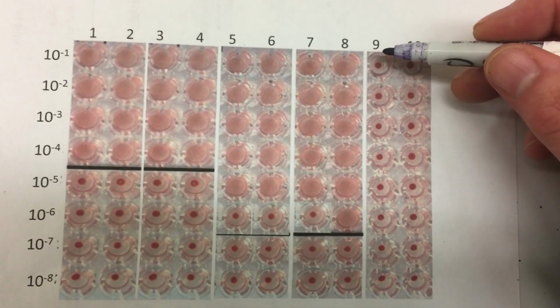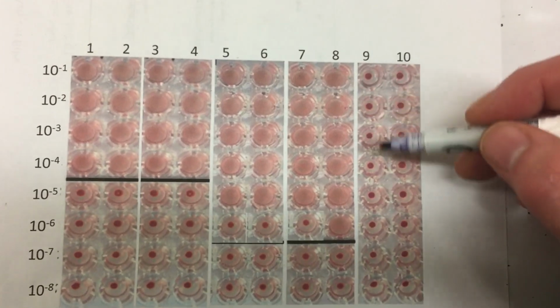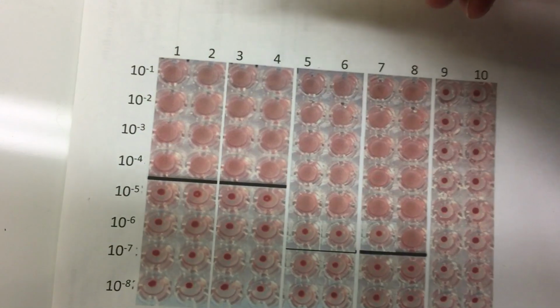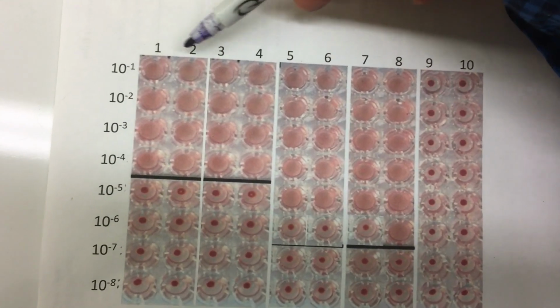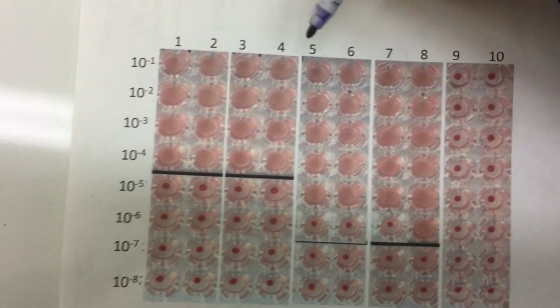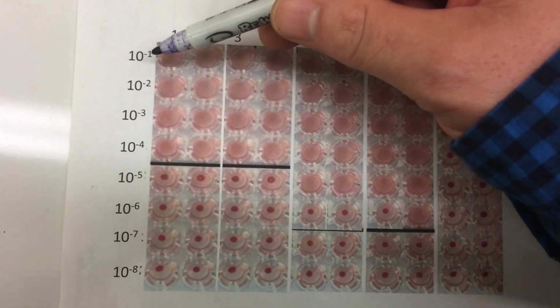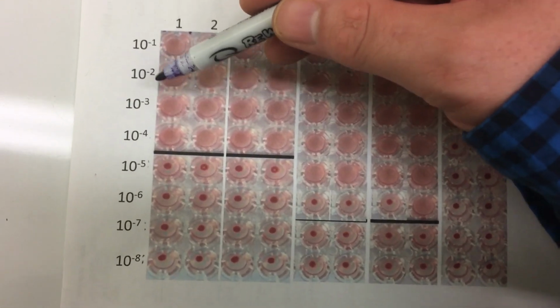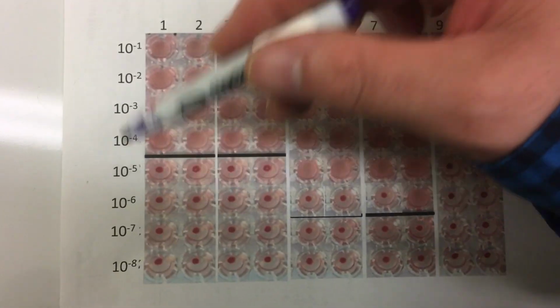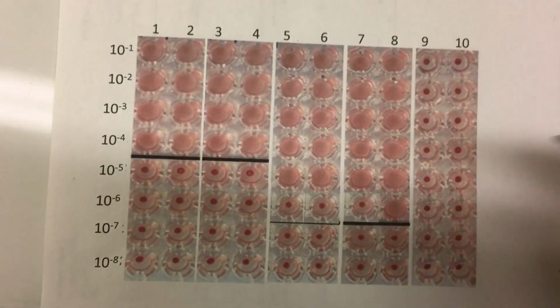So assuming that 9 and 10 are a negative control, we can see throughout our dilutions there's a bunch of buttons, so there's no virus, which is what we'd expect with a negative control, okay? Looking at the rest of the plate, we have one sample that's 1 through 4, and another sample that's 5 through 8. Both of these samples have been diluted tenfold down the plate. The first well is diluted tenfold, the second well 100, the next well 1,000, and so on down the plate, okay?